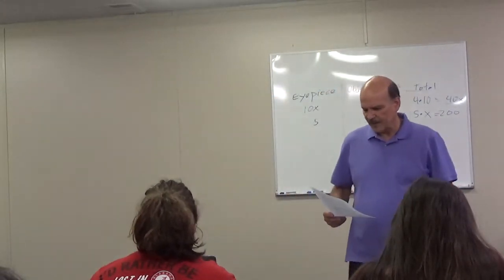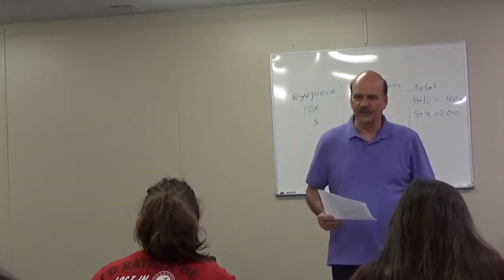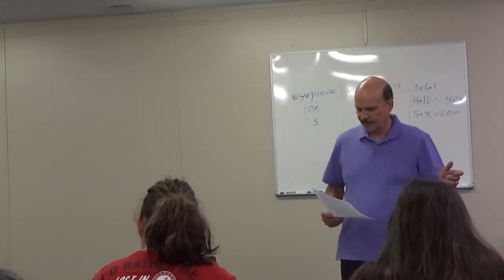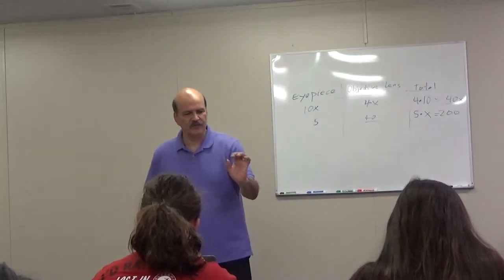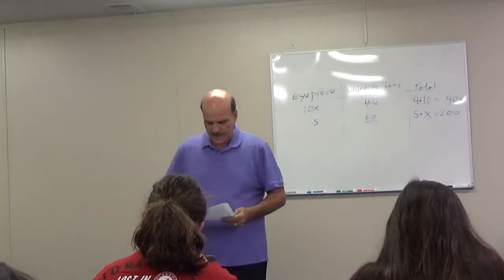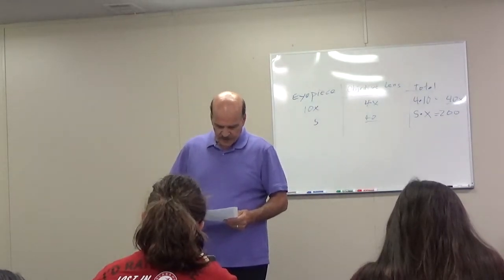Question 5, I thought B was a little unclear. Use the coarse adjustment knob for fine sharp focusing. Well, obviously, the coarse knob is for the coarse adjustment. Fine uses the fine knob. Sometimes on one of the scopes it's the same: there's a bigger one and a smaller one, right? So, I don't know if there are any more questions.